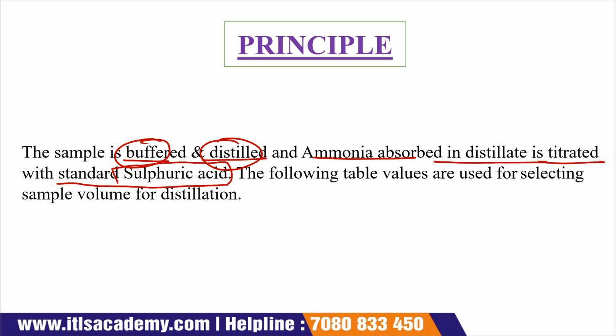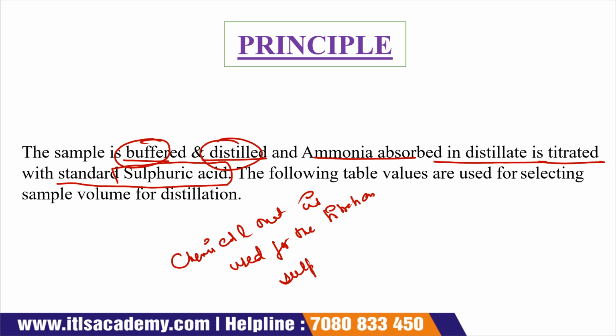So the chemical that is used for the titration is sulfuric acid.